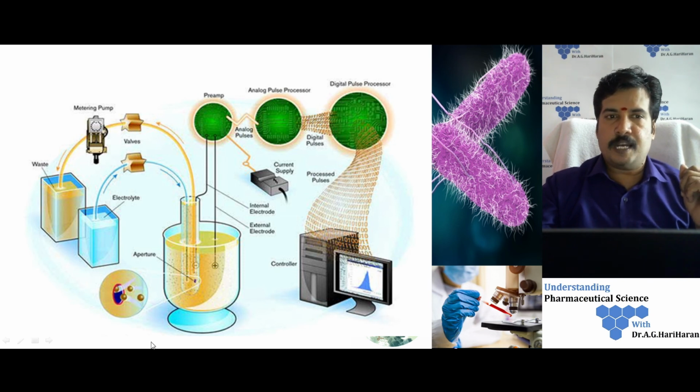To maintain the electrical flow, we pump an electrolyte solution, so a normal electrical flow is present continuously. Once we start withdrawing liquid from the inner chamber, a tube-like structure withdraws the liquid using a metering pump, which goes to the waste. During withdrawal of the sample, the microbial cells present in the outer chamber start moving inside through this orifice. You can see this in the amplified picture.